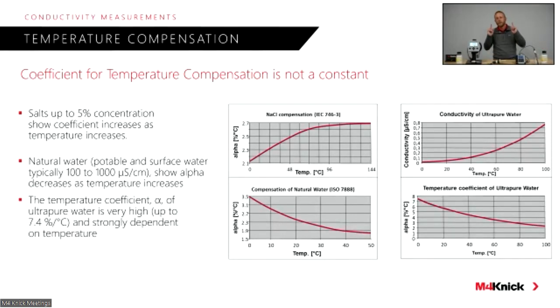So very important to select the right conductivity sensor based off your application and the characteristics of that application. And then further, very important to take temperature into account and specifically understand what solution temperature compensation is and how it can benefit you.